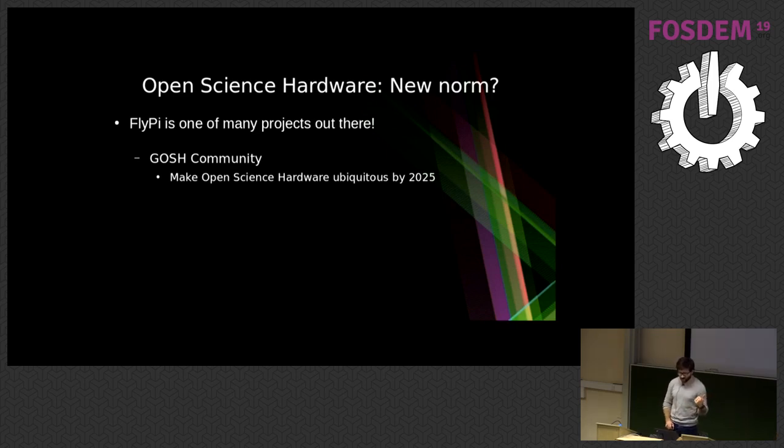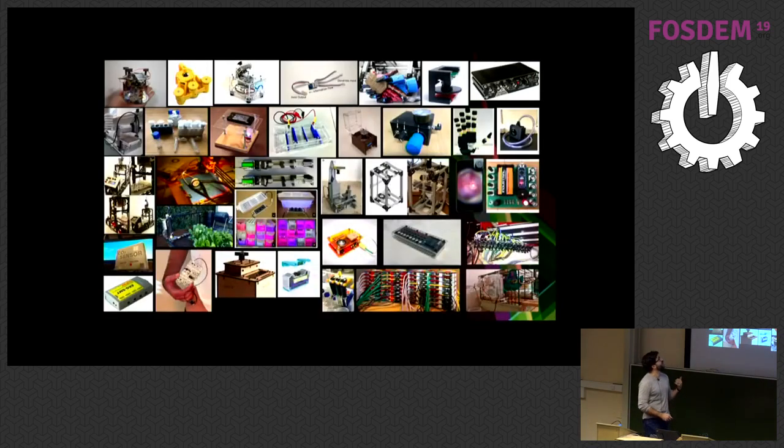And here, just to show you what I mean by there are many, many other projects. These are all open source projects that are related to science that are available out there. And so you have, you know, prostheses, and you have different types of microscopes. You have artificial neurons for modeling and for teaching. There are little incubators that you can have several different types of plants in them. There is a whole farming bot for those of you who might have heard of the farm bot.